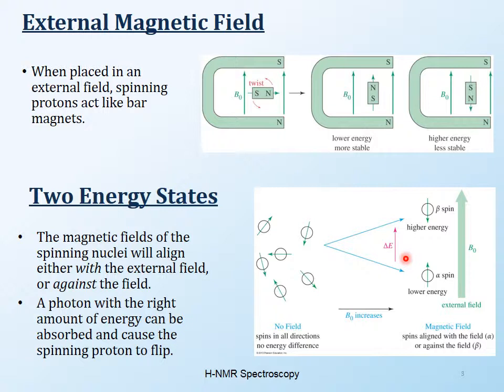And that is given by what we call the radio frequency. If you remember radio frequency from the electromagnetic spectrum, that was the lowest energy in the spectrum. So that is what is given in order to flip a nucleus with the magnetic spin from with the magnetic field to the opposite of the magnetic field. So that's what is measured in the NMR, all right?